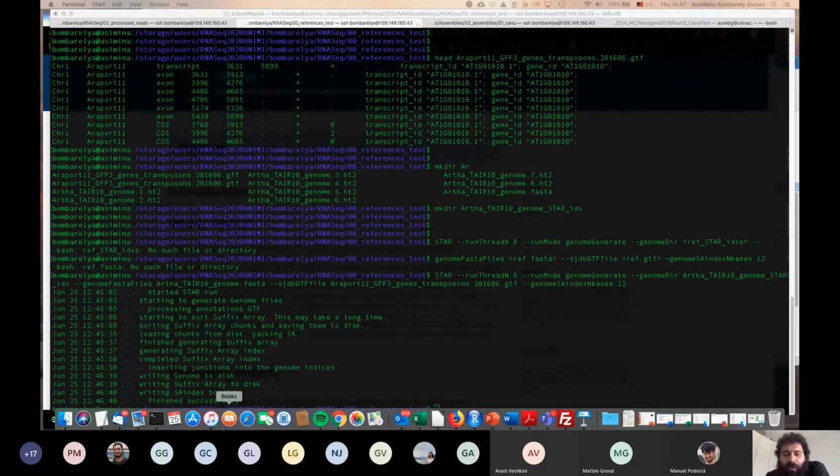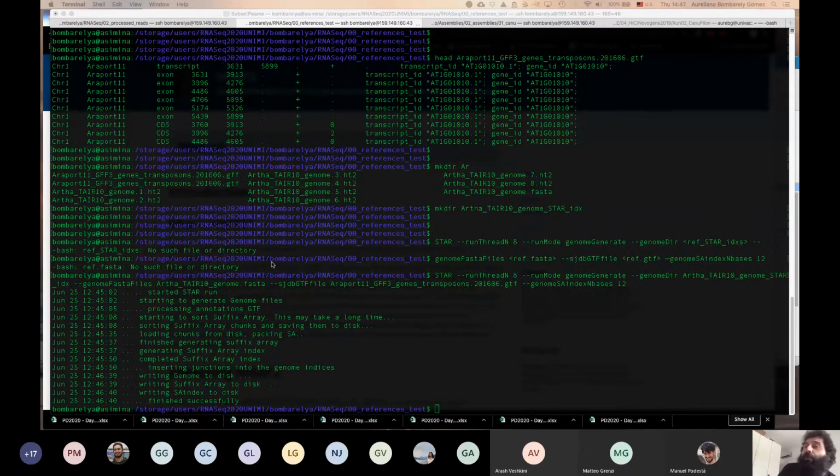How many of you were able to get the STAR BAM file? Okay, I guess that some of you are still running it. Perfect. Happy to see that this is working. These have already finished.